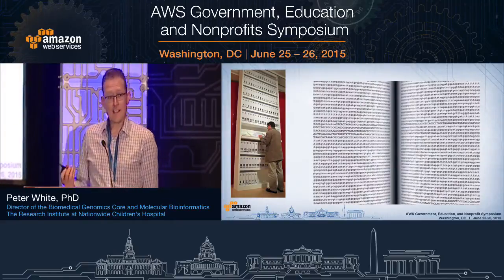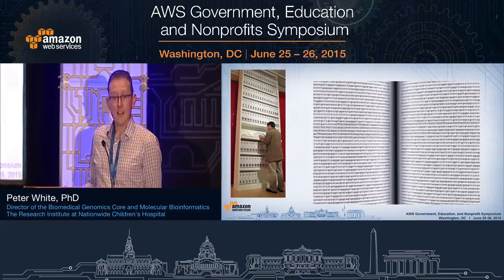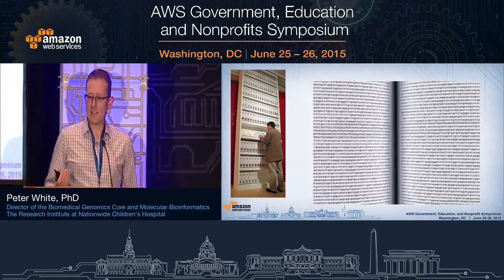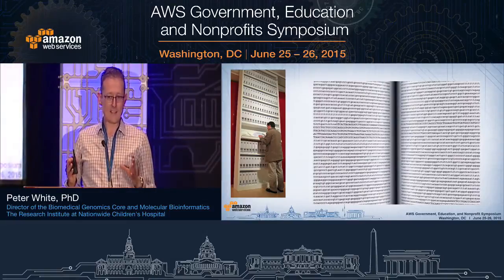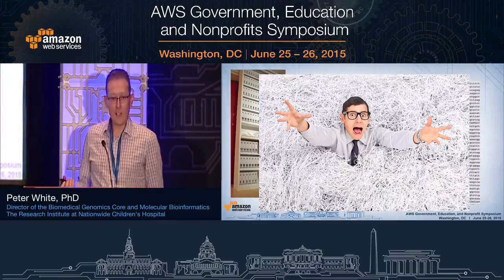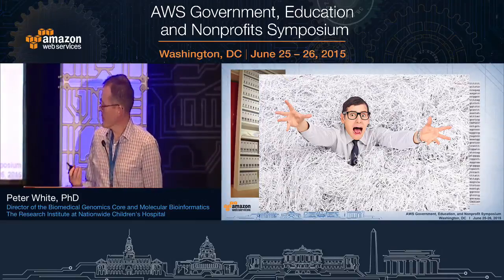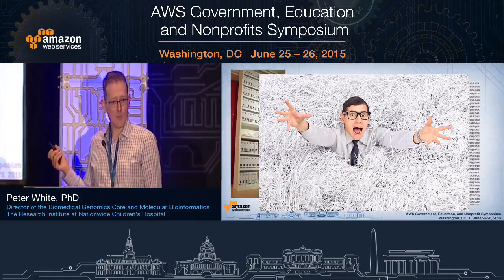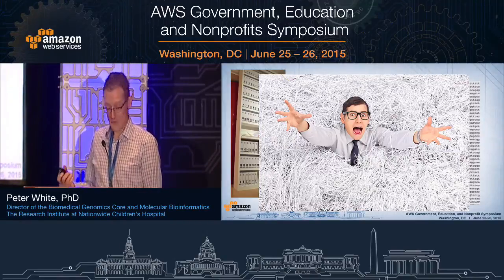It would be nice if the data coming off these sequencers actually looked anything like this, but it doesn't, because the way next-generation sequencing works is the genome has to be chopped into very small pieces and then sequenced in parallel. So it's a bit akin to taking this entire collection and running it through a paper shredder. This is what the output actually looks like. So the analysis process has to reassemble all of those volumes and get them looking back to something readable.